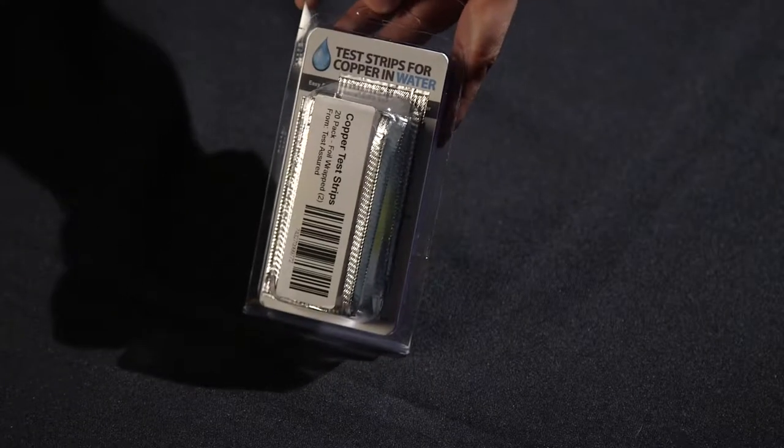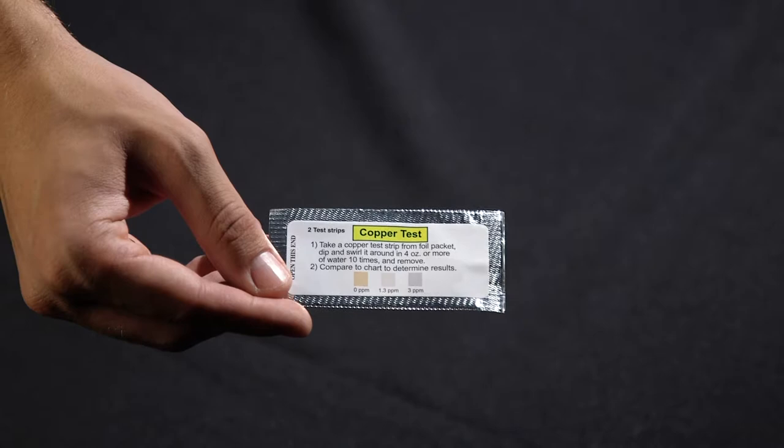For this test, we'll only need three items from your water test analysis kit: a water container, one copper test strip, and your test color chart for comparing results.